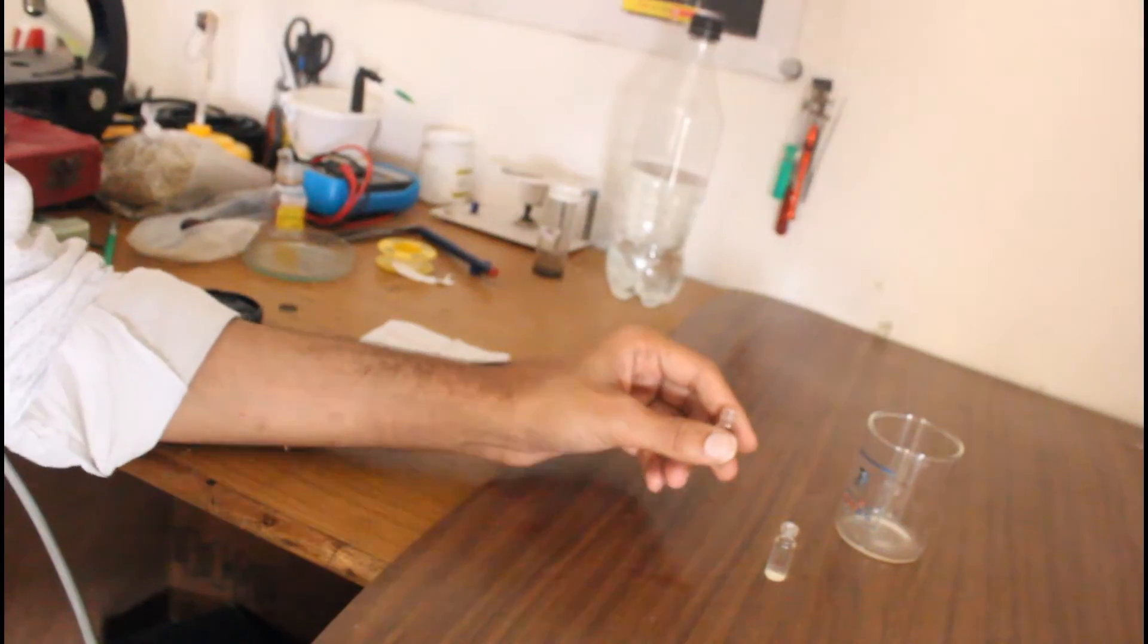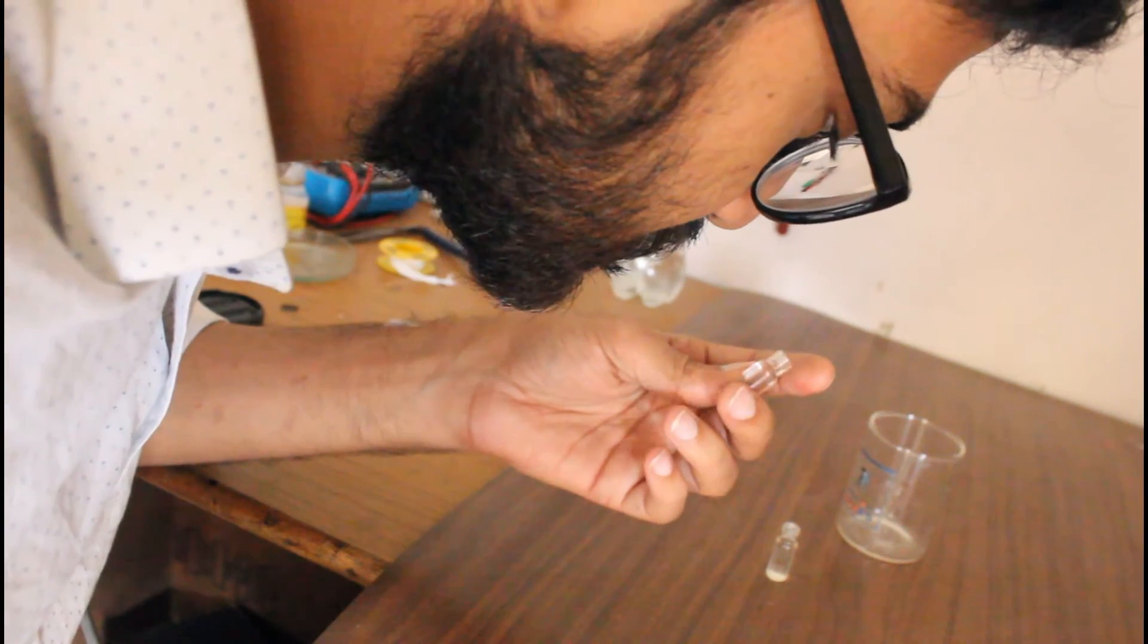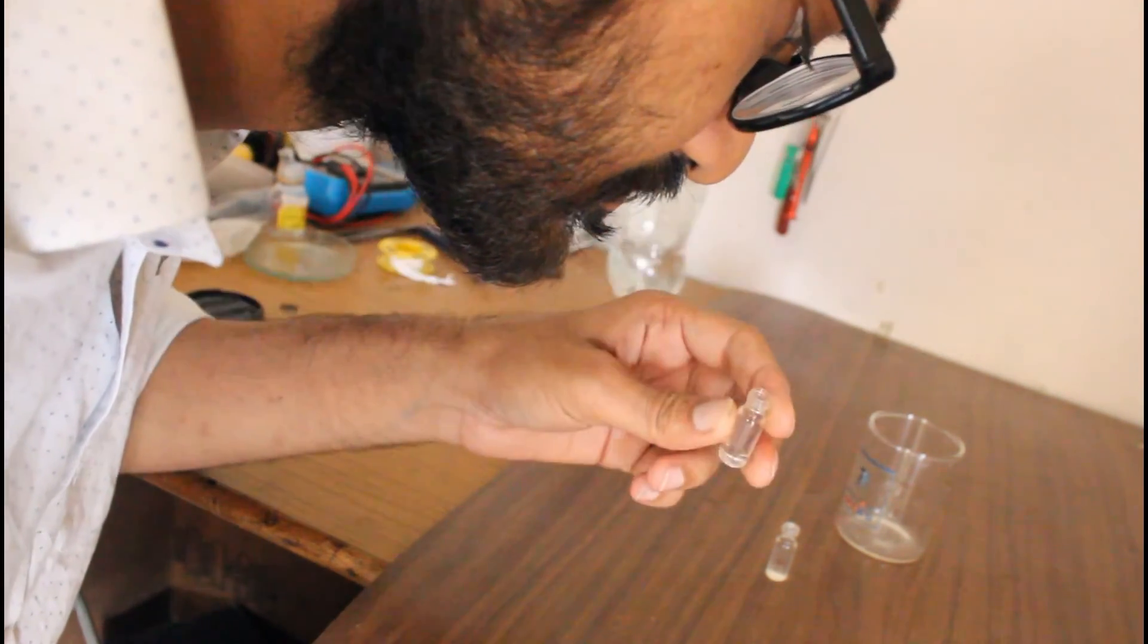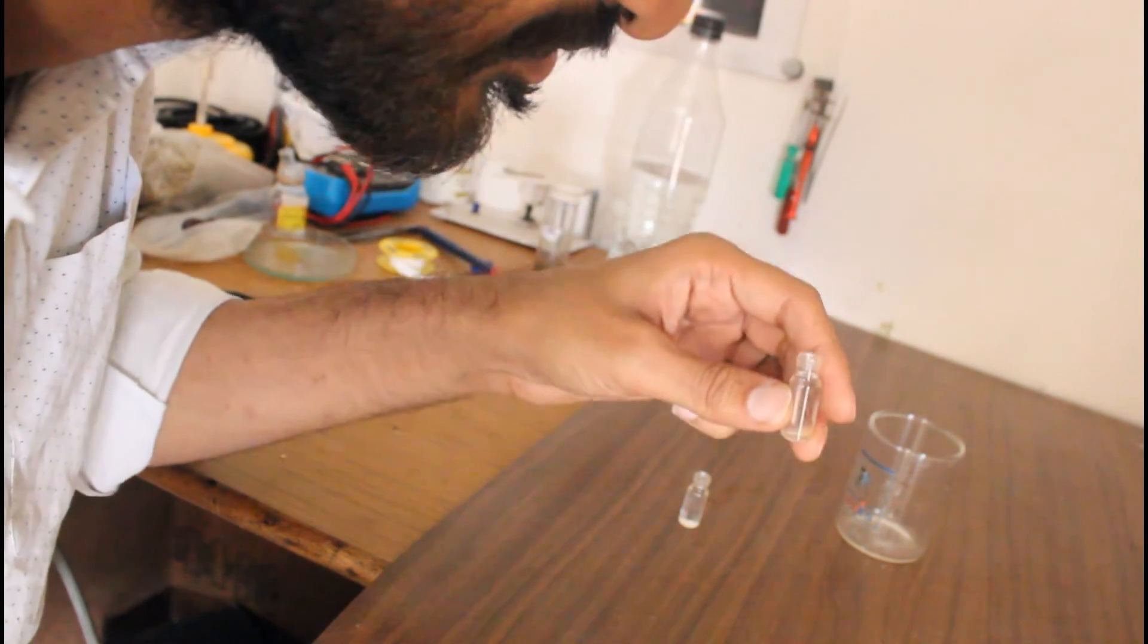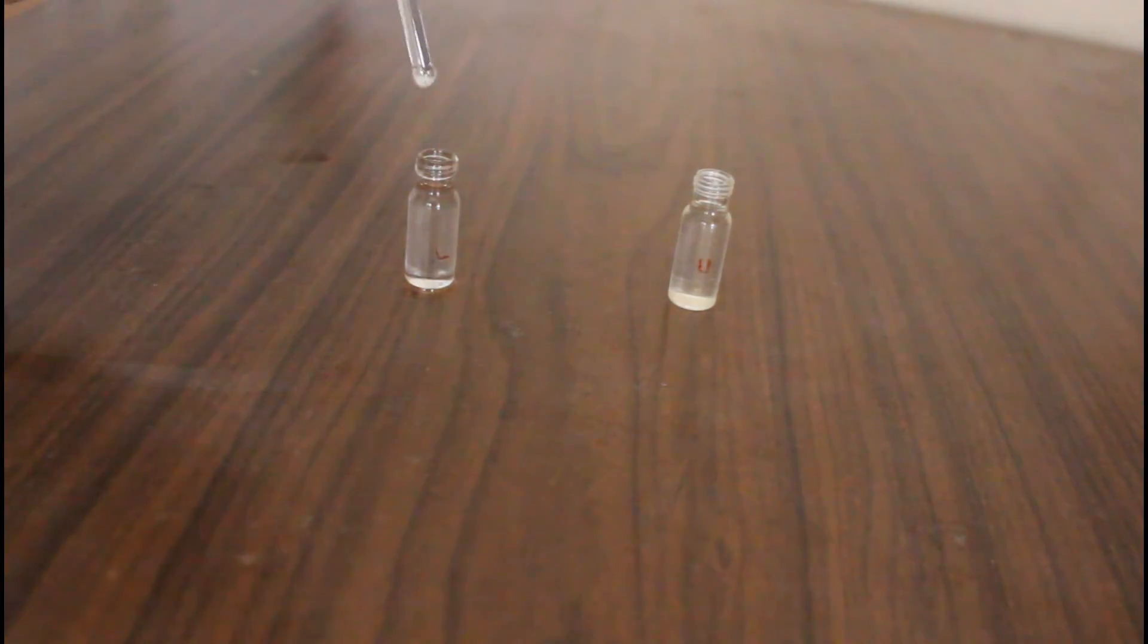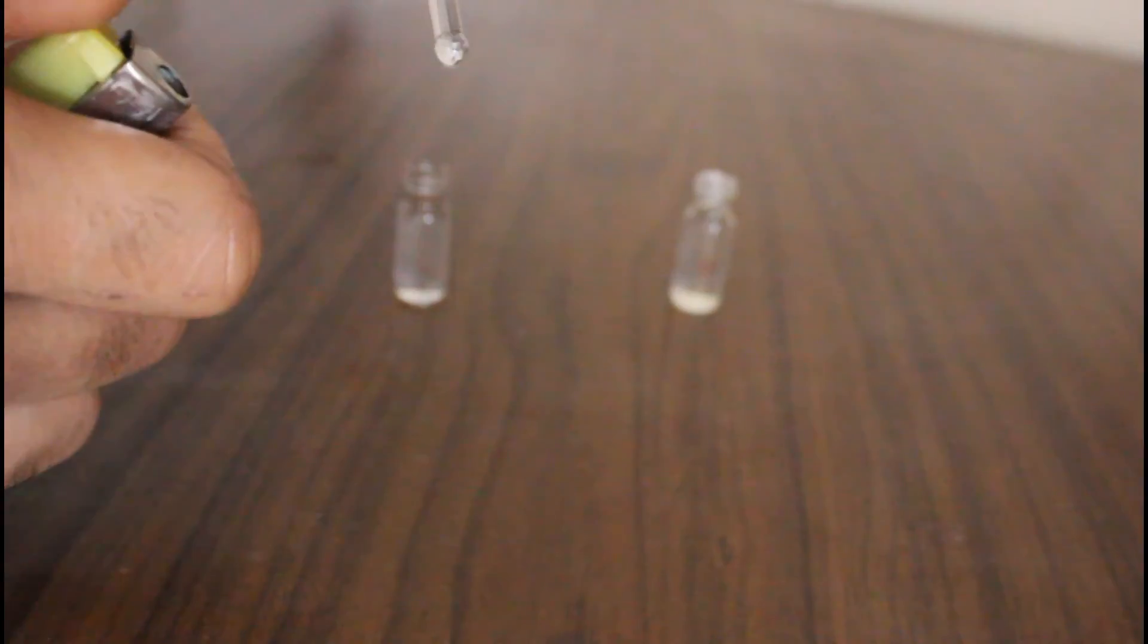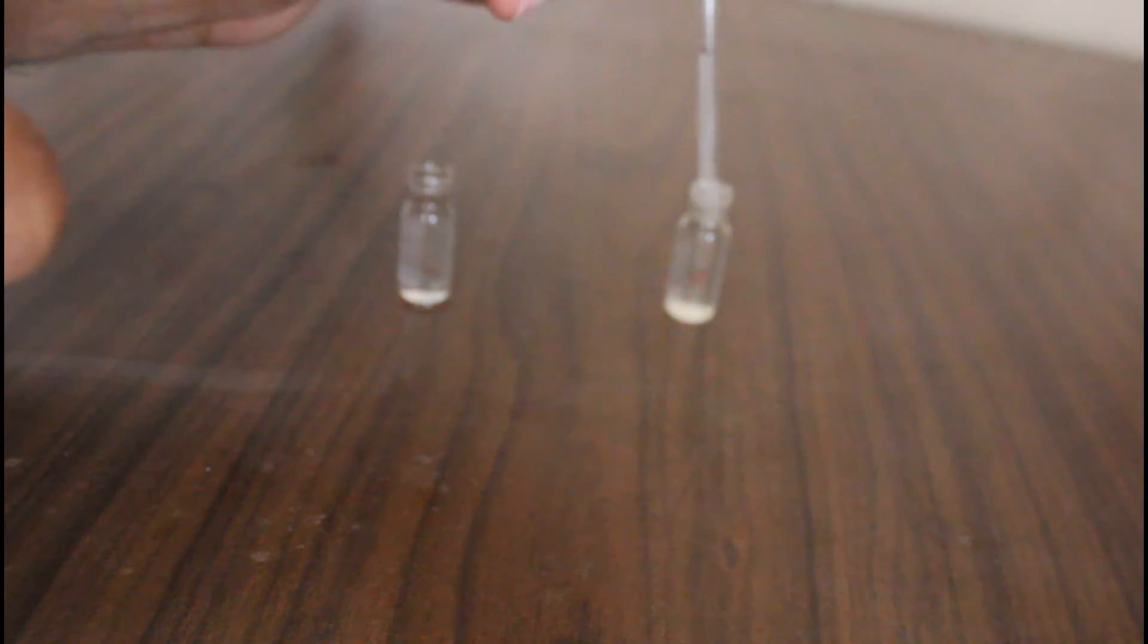The sample L smells like acetone. And this sample U also has a rough smell actually quite similar to the acetone. Let's have a flame test. The sample L burns quite good while the sample U is not flammable.